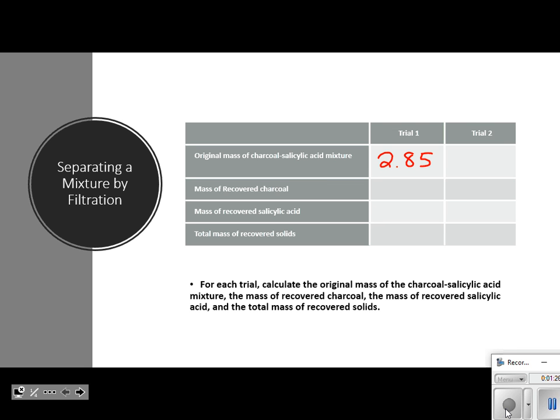All right? So what I probably guessed on those is I said, did you have a measuring dish added in there? Okay. Was there a watch glass added in there? Okay. Did you measure your Erlenmeyer flask wrong? Because something could not be correct because you didn't have that much. You didn't have that much to start with, because I said get 0.6 and take it back, and then we'll go from there. All right?